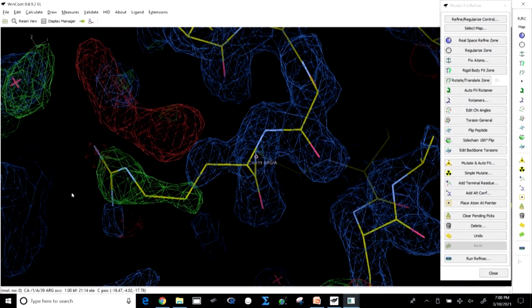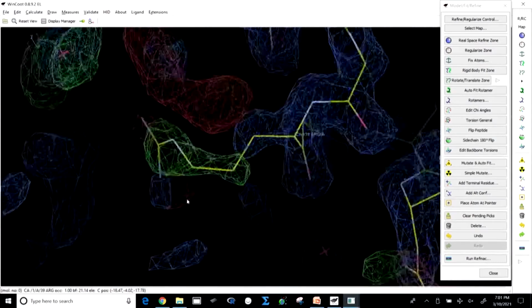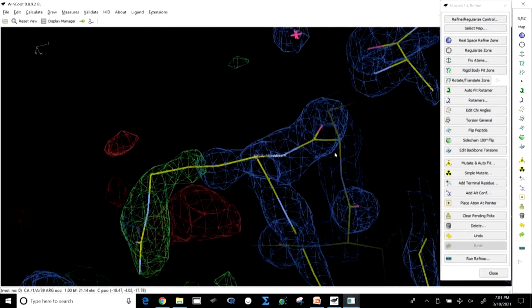Now, using COOT software you could identify the mistake. That is the beauty of COOT. It is not only a visualization interface, but it helps you work like a real time crystallographer. So, I hope I could make this point here.